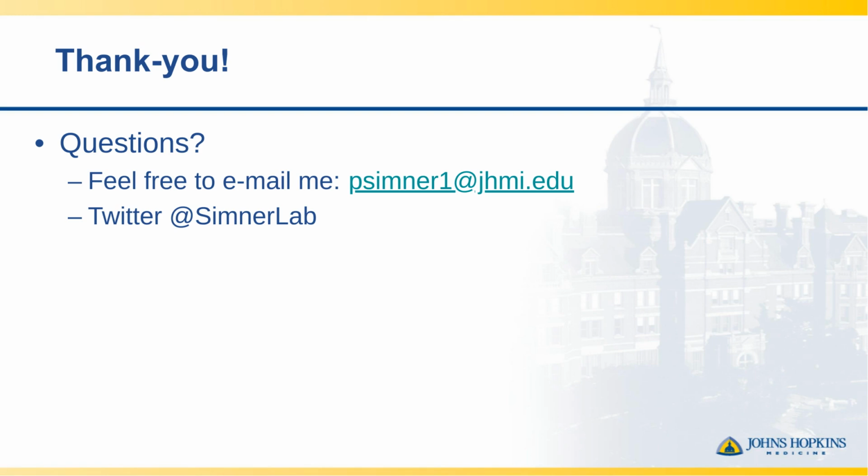Thank you. Next question. You showed a comparison of several automated analytics and pipelines. How are these technologies different, and what differentiates ARES Genetics? Yeah, I think first off, I don't have too much experience with the other analytic pipelines other than ARES Genetics, as I highlighted in the slide there. And so most of my information in regard to the 1928 Diagnostics and the NextGen Diagnostics is what's published in the literature and what they have published on their websites.